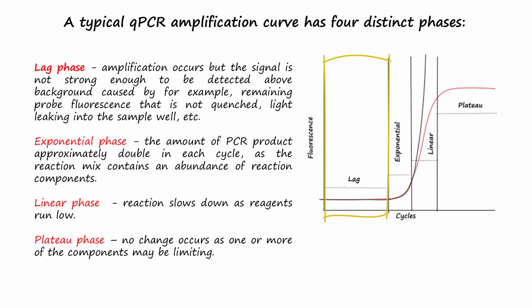The background may be from, for example, the remaining probe fluorescence that is not quenched and light leaking into the sample well.